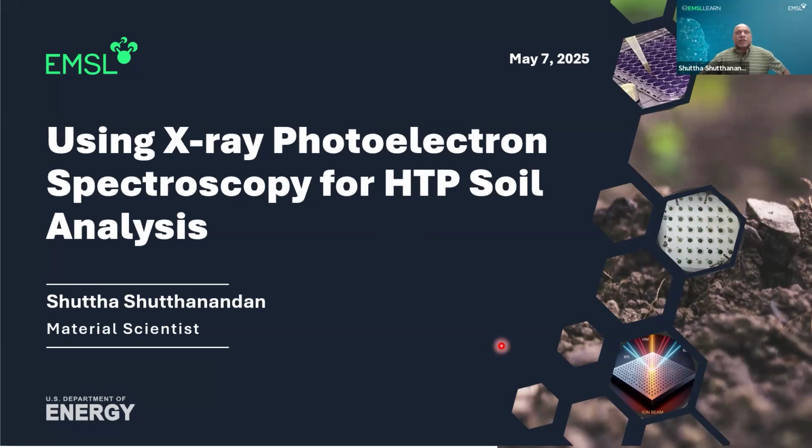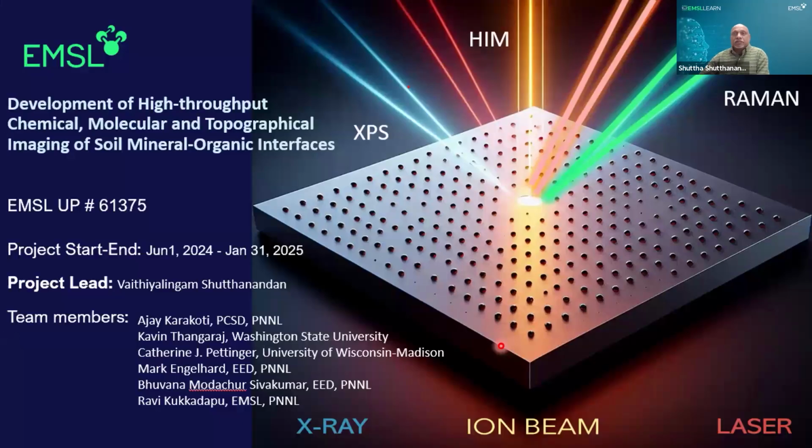Okay. Thank you, Linda. Thanks for the introduction. So today we are going to show you how we can use XPS, or X-ray photoelectron spectroscopy, in advanced soil analysis. This project is funded by an EMSL FY24 proposal, and here is our team from different directorates. It is a very successful project, and we will show you some data from this high-throughput methodology.